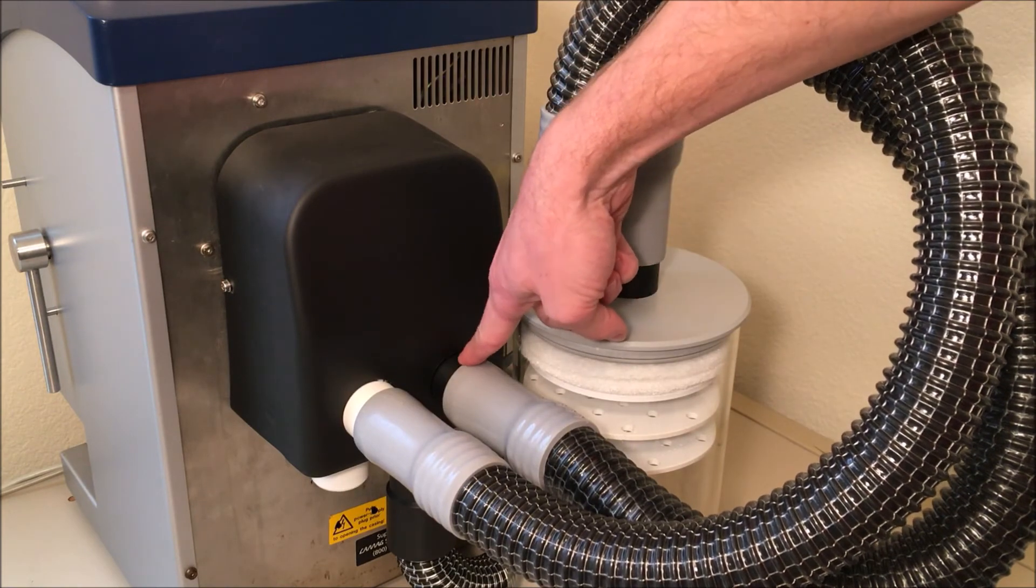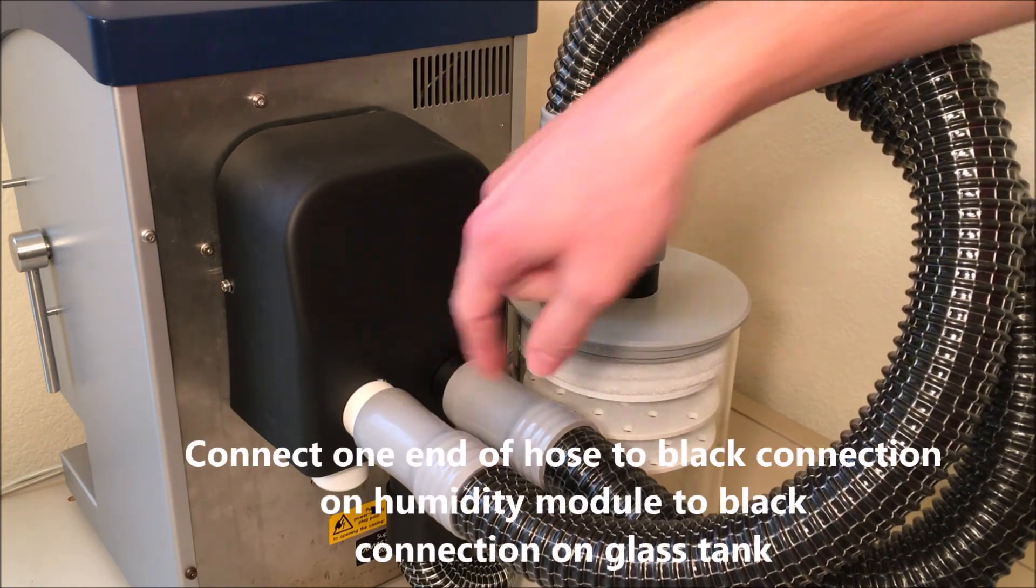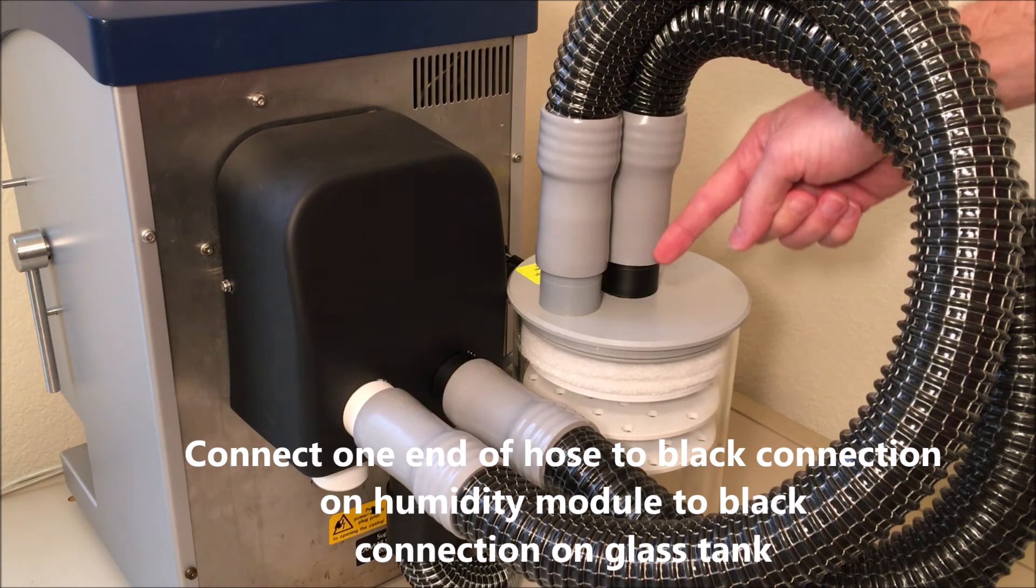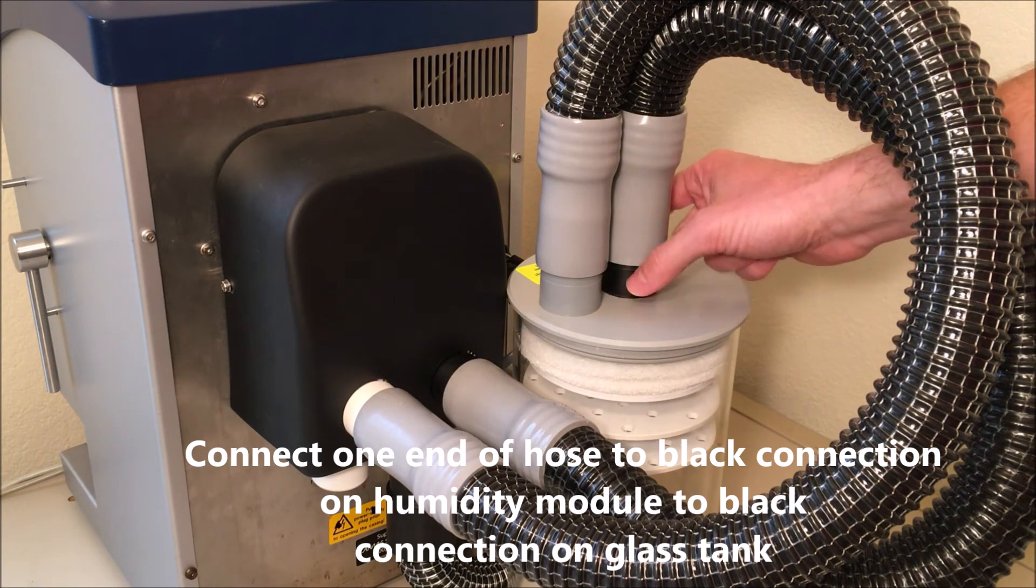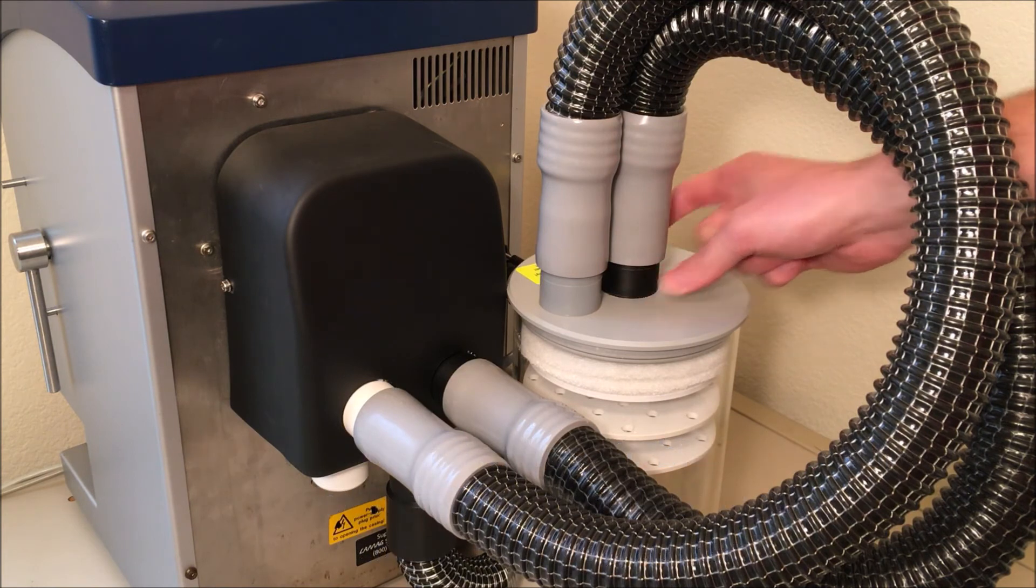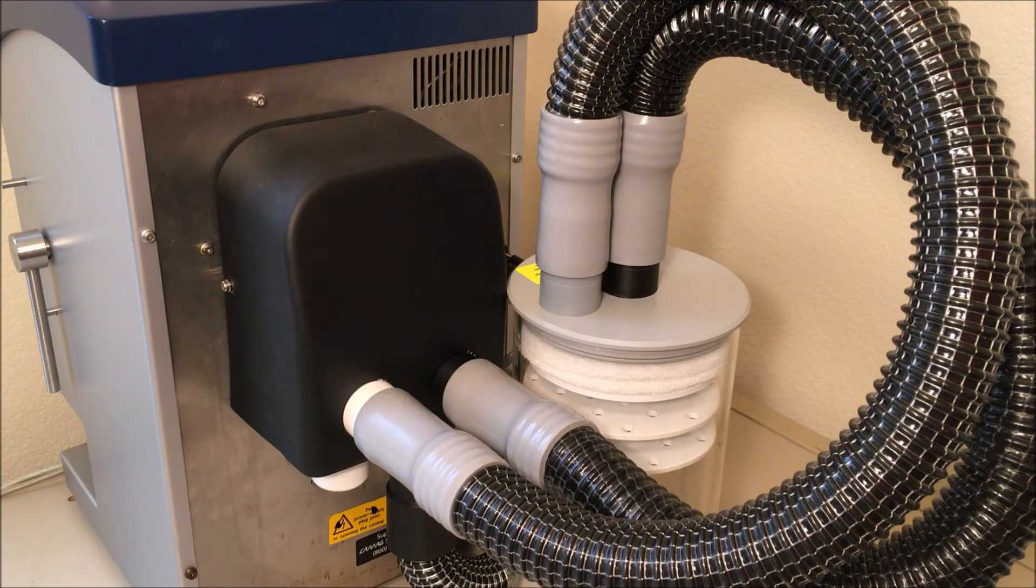Then the right tube which is the black connection would then be connected to the container with magnesium chloride on the black connection, usually the center connection here. So you can see that it's actually quite easy to just match up the colors and that's how you know you've properly connected the tubing.